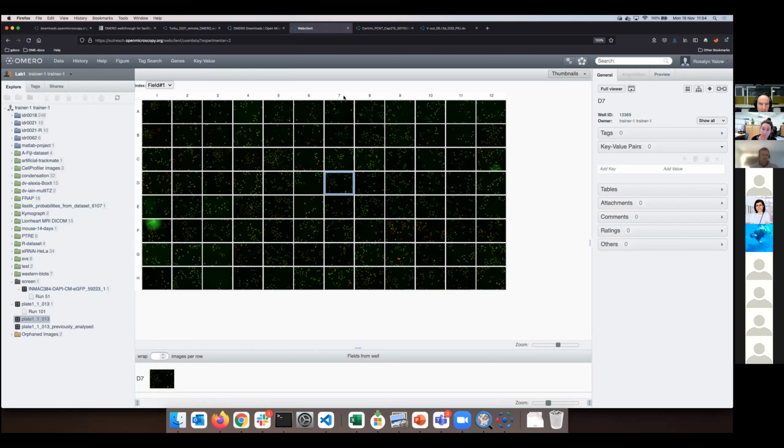Okay, so Diane is asking, is it possible to link an image to a large group of students in a course where the teacher only wants the students to be able to work with one specific image? Well, yes, probably. If I understand your question right, you would be able or not able to see any image according to how I did set it up for you.